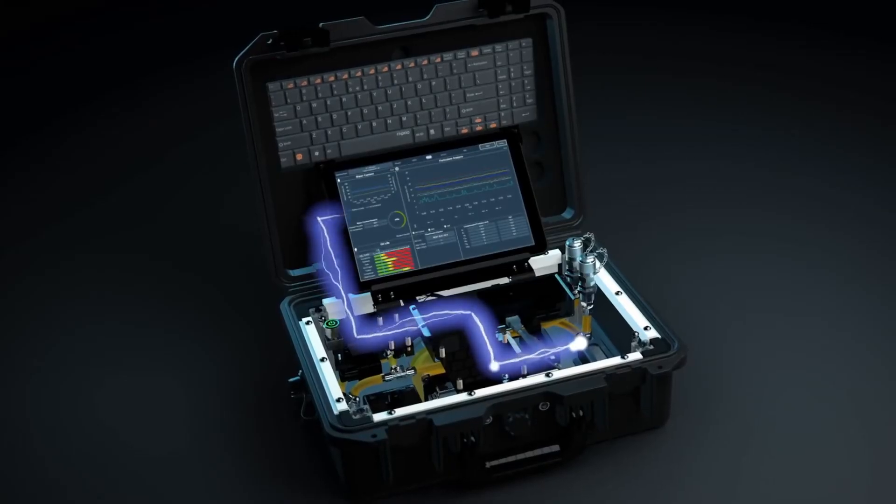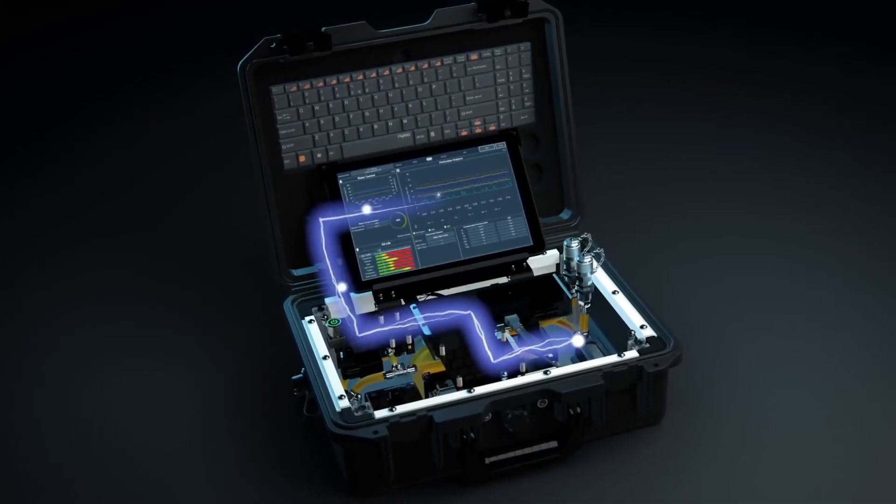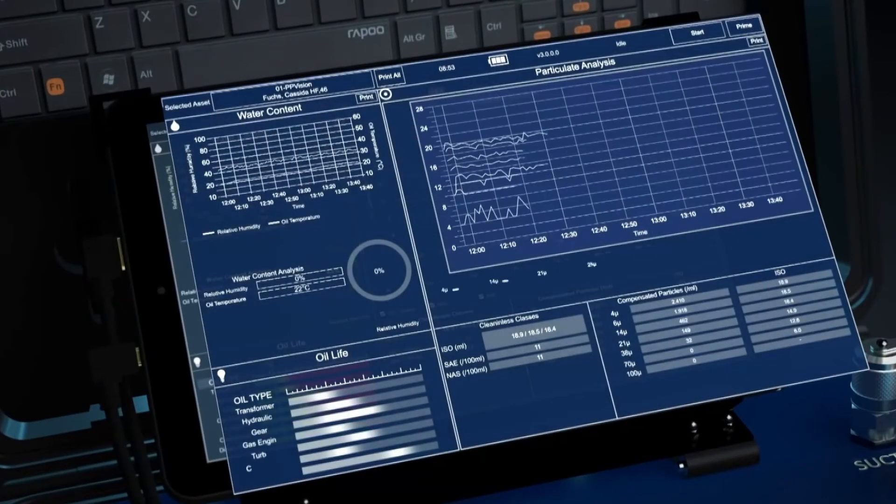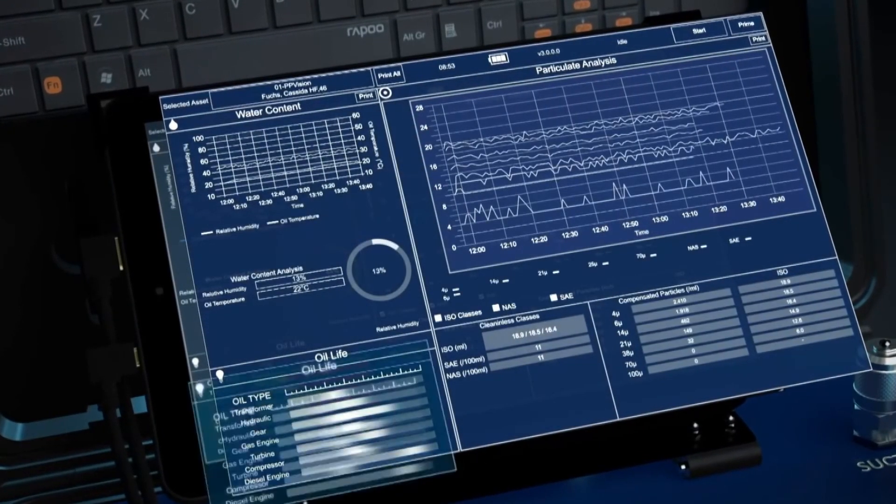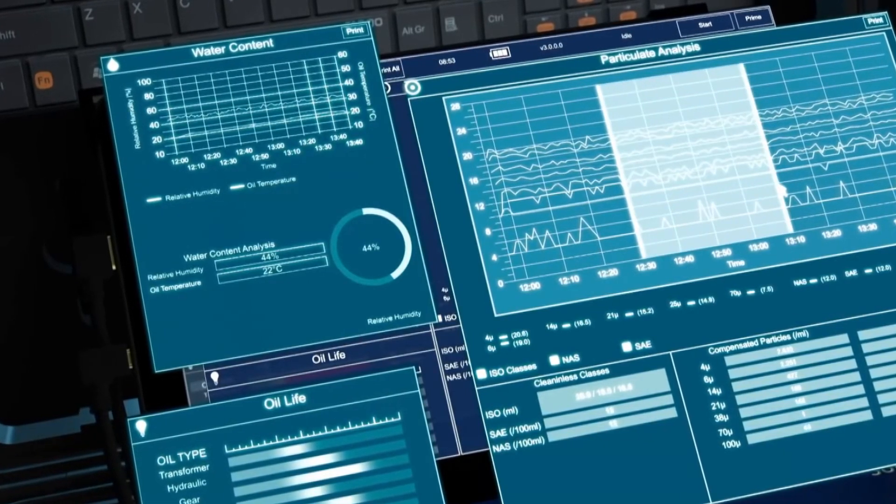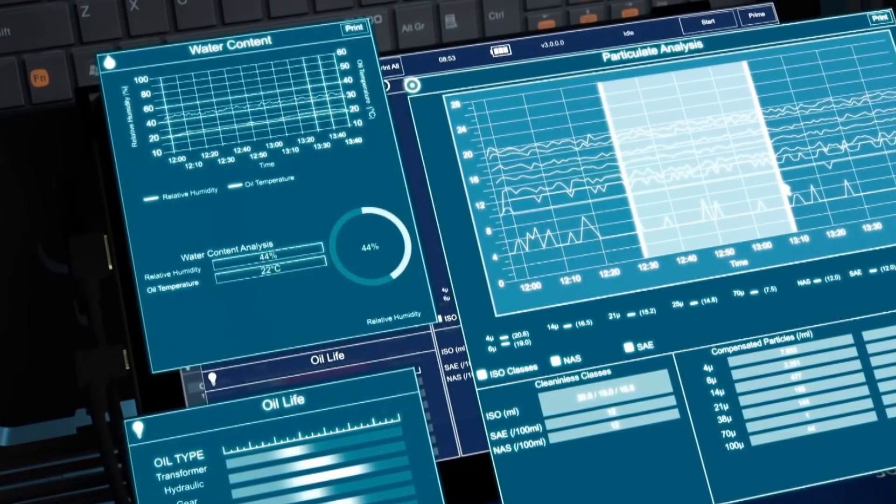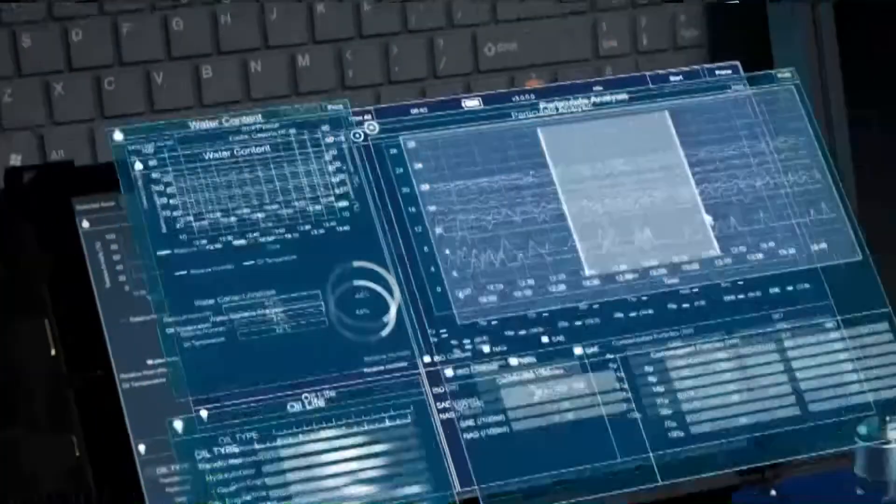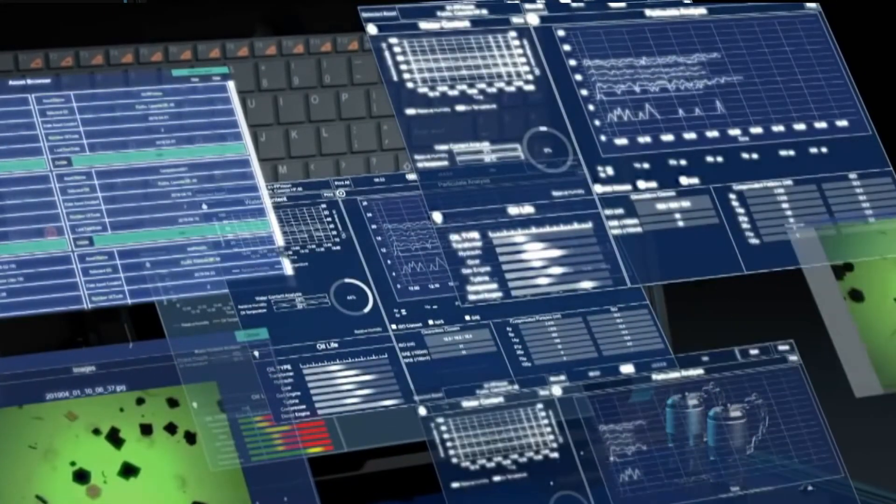Readings from all sensors are analyzed by our oil life software, calculating and displaying key information in a wide range of empowering infographics, charts, tables, and data sets, with the ability to give average readings of specific sets of data. This data provides critical insights into remaining oil life, detailed particulate analysis, and oil condition.